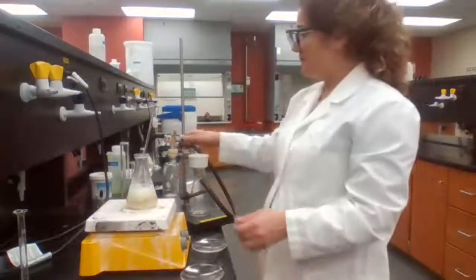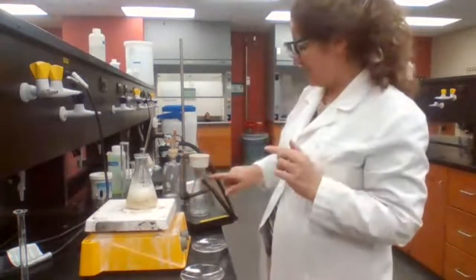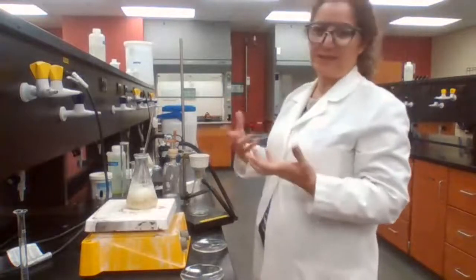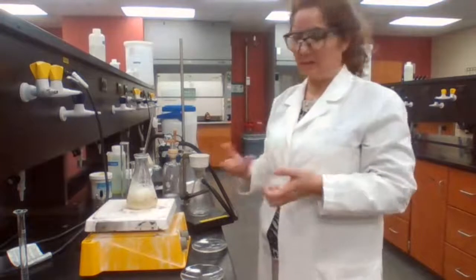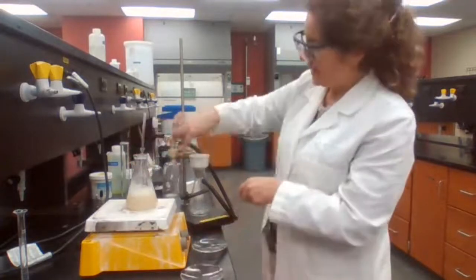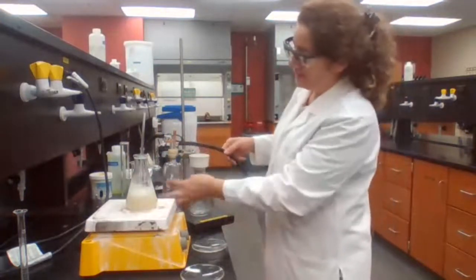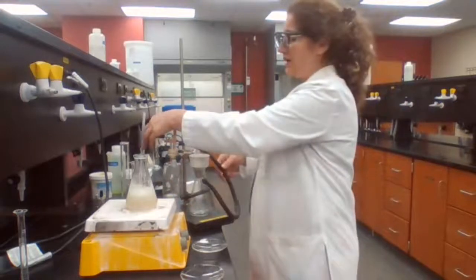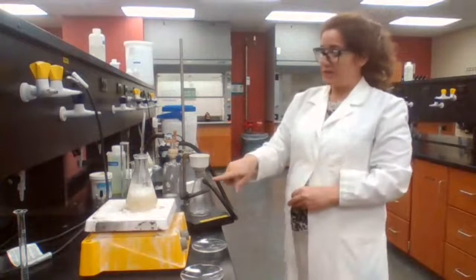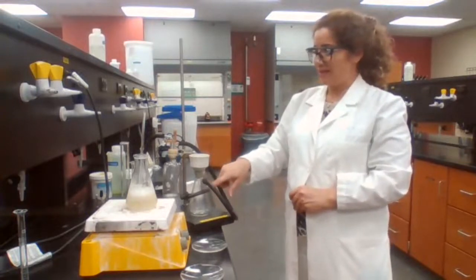The purpose of the trap is to make sure that no liquid goes into the vacuum pump, because the pump is electronic and you don't want to put any water in it. If any liquid goes down, it is caught in the trap before it reaches the vacuum system. You should never fill the flask more than about two-thirds.